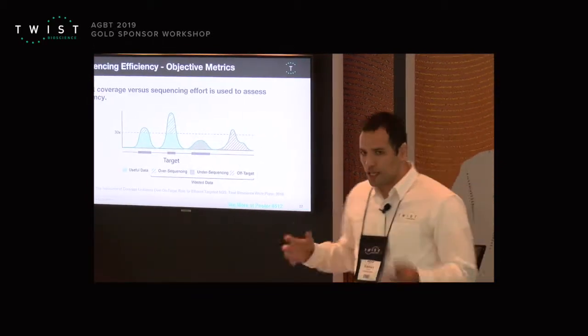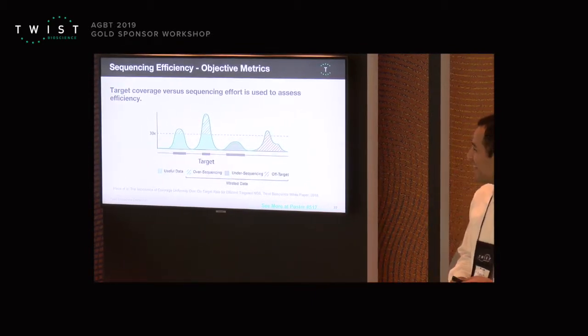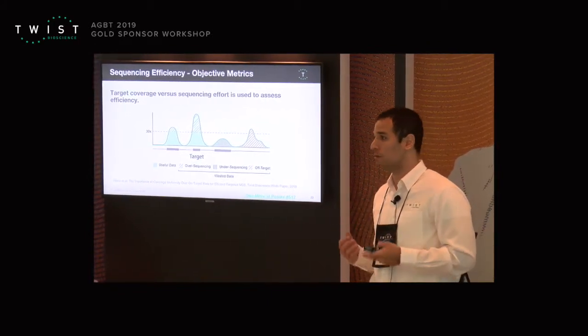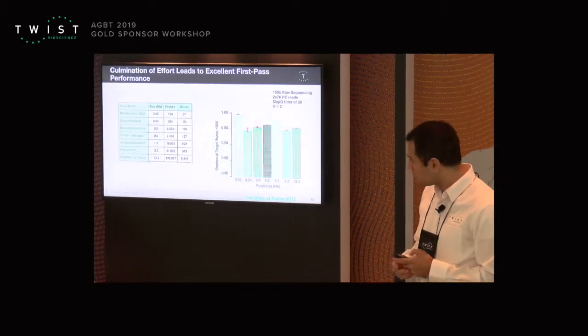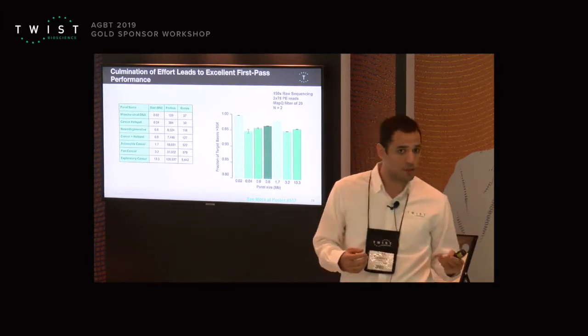So, I just gave you a flavor. There's a lot more, and obviously I couldn't share everything here. But we take all that, and now we can make panels on a first pass using all our learning to make good panels. And here's an example of 7 panels that we made. This is the first shot at each panel using our design algorithms.